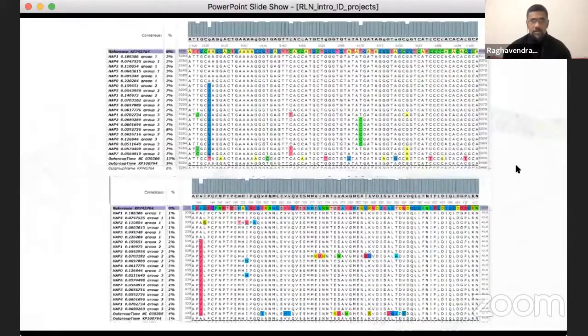Furthermore, multiple sequence alignment will reveal a number of variations in the sequences of different viral strains. A careful analysis, and learning how to perform it, will help us identify critical mutations that can cause significant changes at the amino acid level among these different strains. These mutations can be related to the virulent properties of the pathogen and will help us characterize viruses like EVD68 or SARS-CoV-2, which is currently a very dangerous pandemic, based on their pathogenicity.